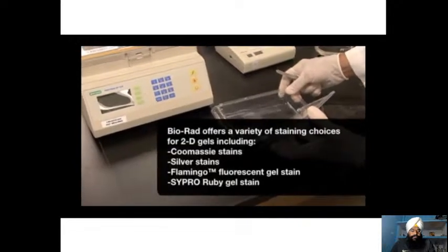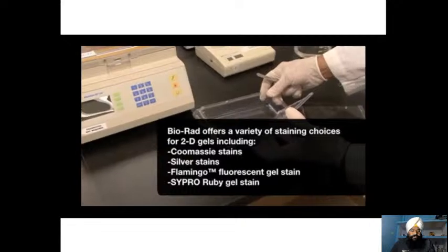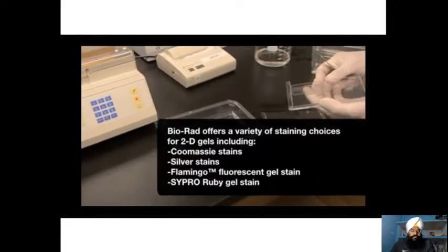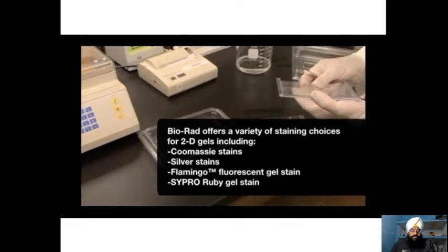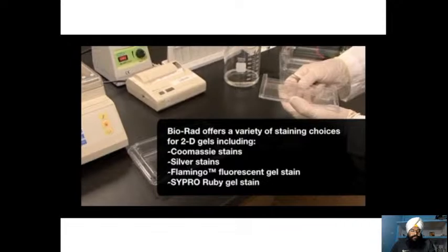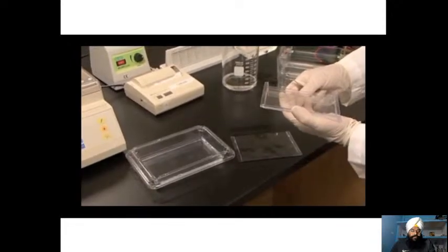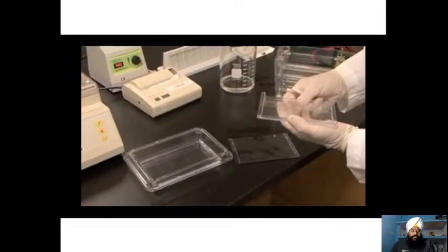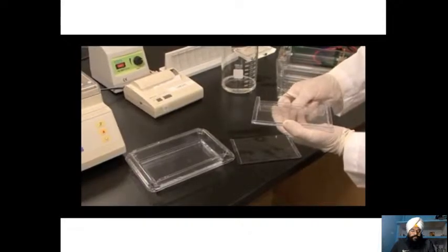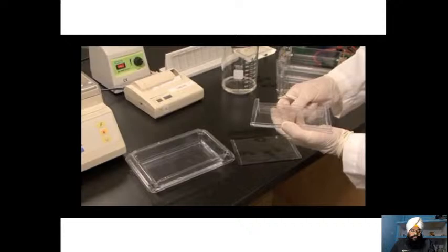Bio-Rad offers many different staining choices for 2D gels, ranging from the visual stains, the traditional Coomassie and silver stains, to the fluorescent stains, Flamingo and SYPRO. In this case, I am staining this gel with BioSafe Coomassie, and the first step requires 3 10-minute rinses in water to remove SDS from the gel.